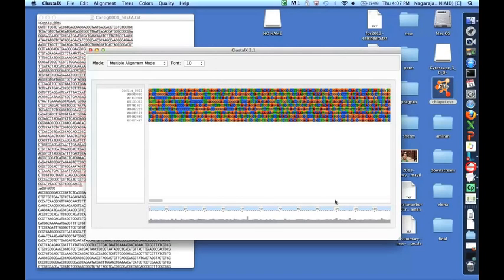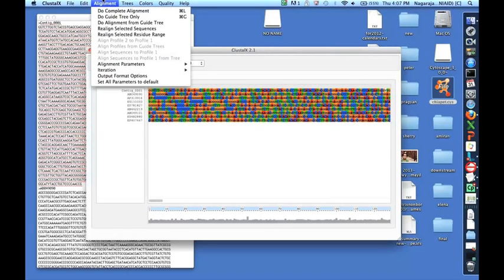Once you're happy with the sequence data loaded into the program, you'll need to set up some output and alignment parameters. Generally, the default alignment parameters should be good for your data. You will definitely want to take advantage of ClustalX's multiple output format options so that the next step in your analysis is easier. Go to the Alignment menu and choose the Output Format options.